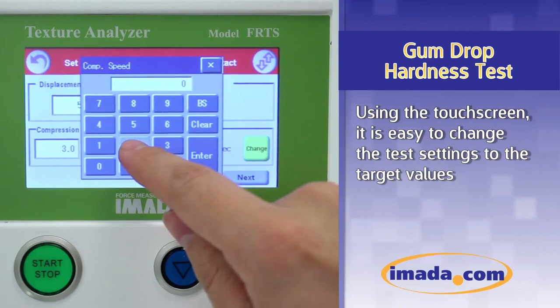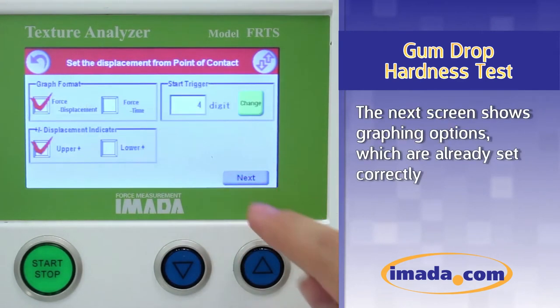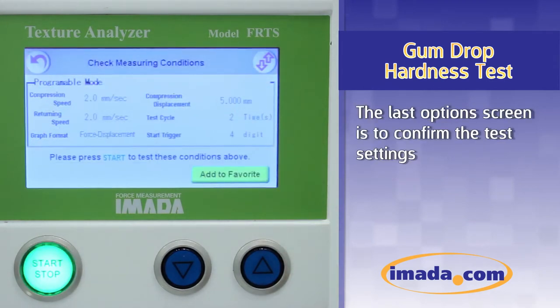Using the touchscreen, it is easy to change the test settings to the target values. The next screen shows graphing options which are already set correctly. The last option screen is to confirm the test settings.